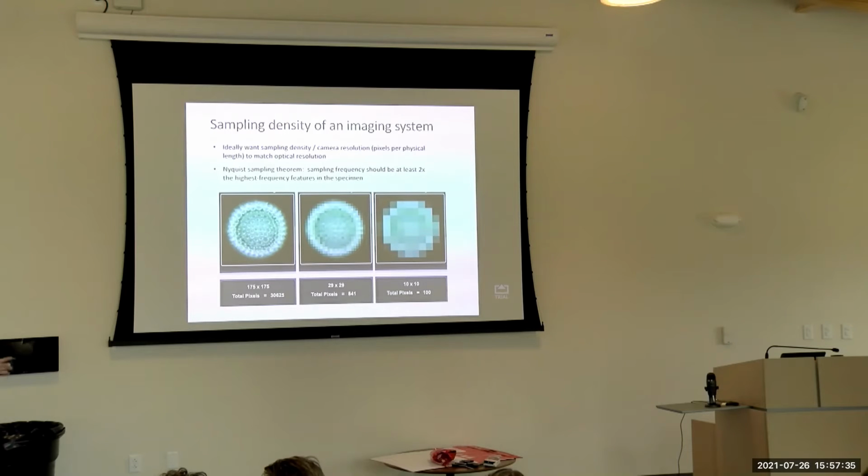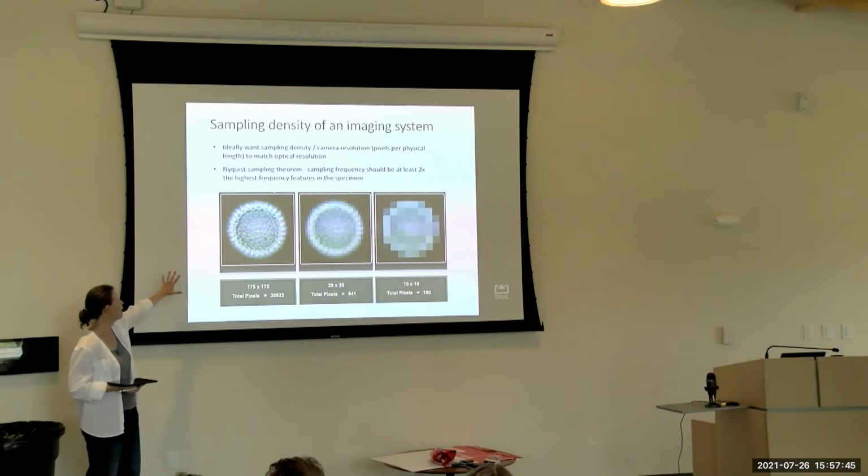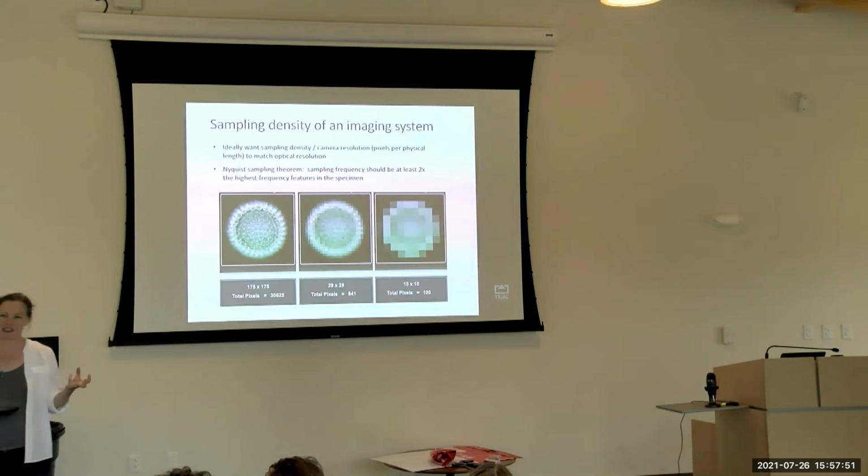And you want the camera resolution to match your optical resolution. I'm showing this purposefully fuzzed out view of a radiolarian cartoon to illustrate this. If you have really good optical resolution, it makes no sense to have a digital sensor that can't capture all of that.